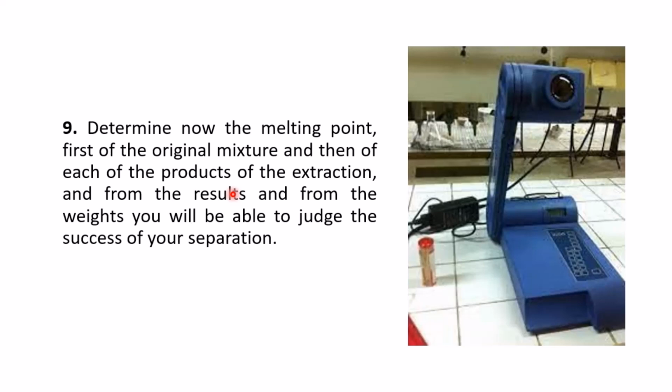After concentrating it to a certain volume, you can filter it using gravity filtration, and then you determine the melting point of the content you have now. You determine the melting point first of the original mixture and then of each of the products you've extracted, and then you compare your results as well.